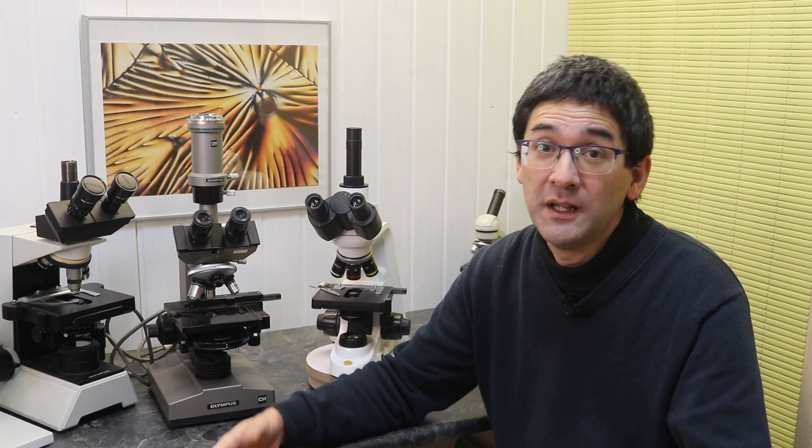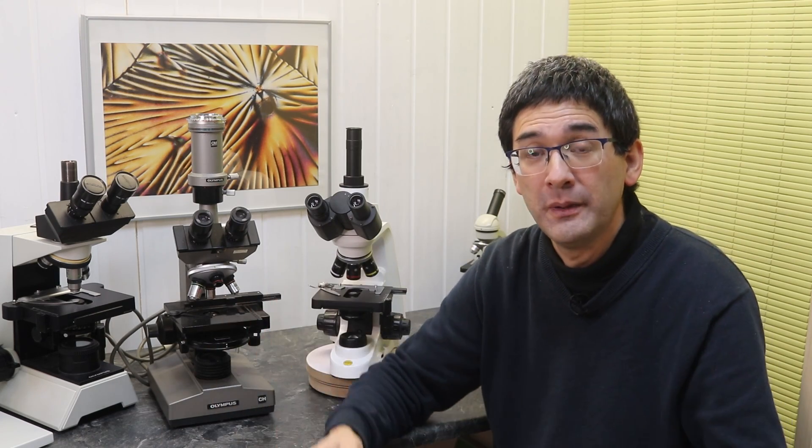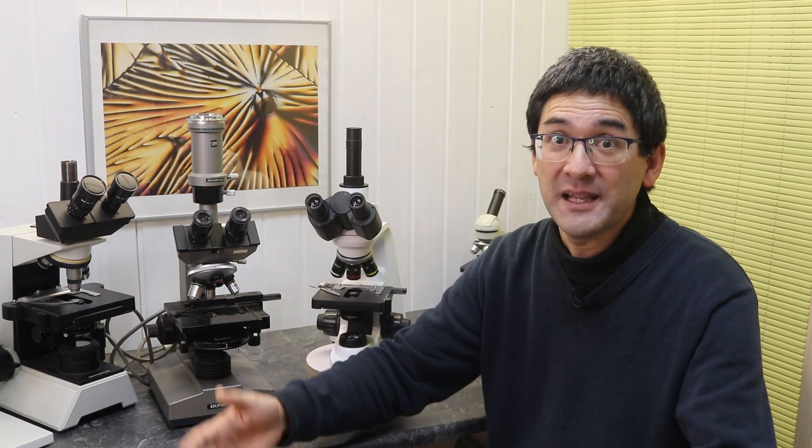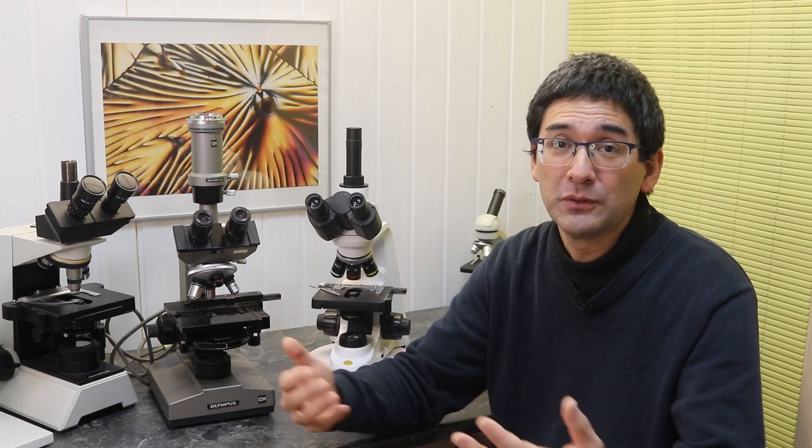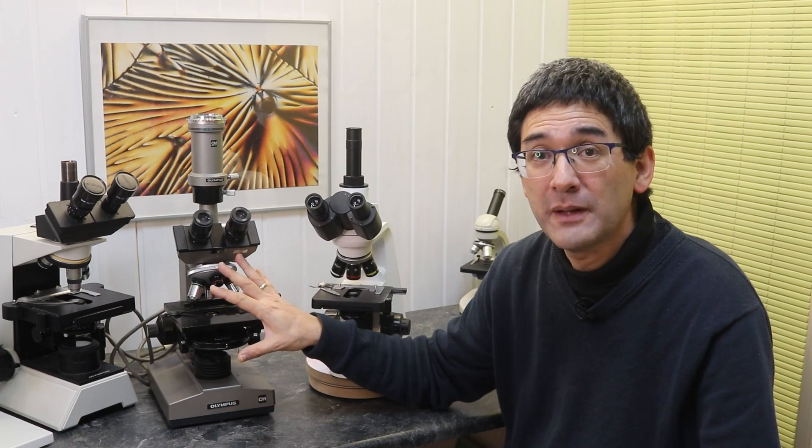If you just go on eBay and search for the Olympus BH series which was very popular 20, 30 years ago, the Olympus BH2 for example, this can be quite expensive, even though it's used, approximately the same price or more expensive than some of the new microscopes. If you have parts that you want to reuse and you build up your own ecosystem, some amateur microscopists specialize on Zeiss or Olympus microscopes and collect the parts and assemble their own microscope.